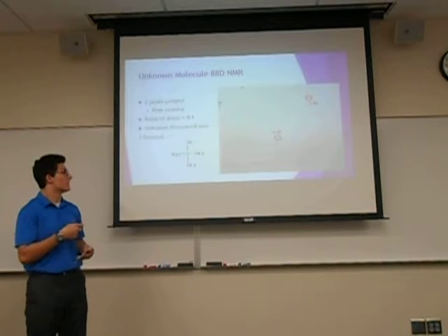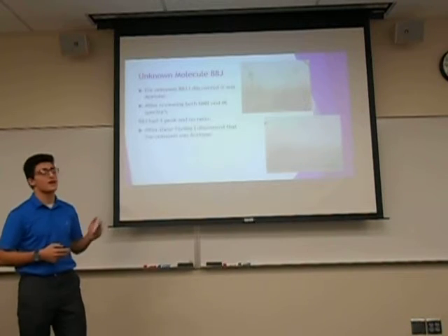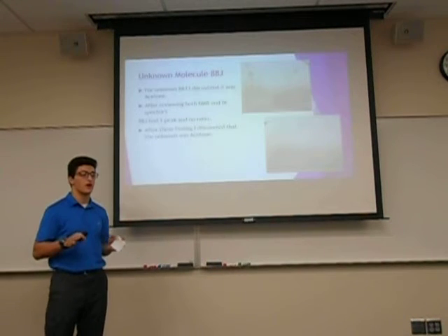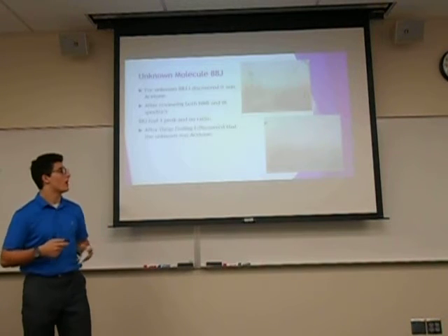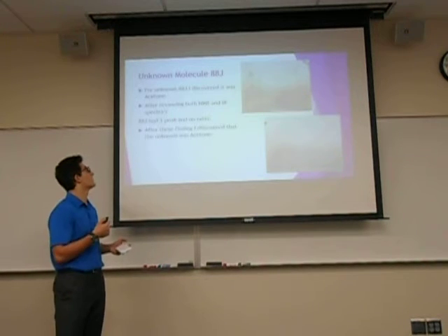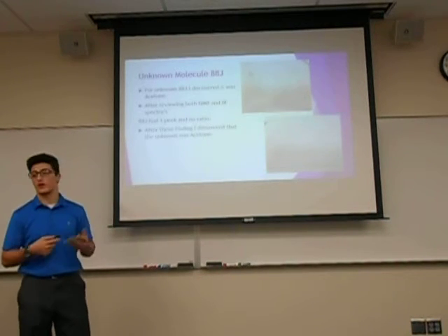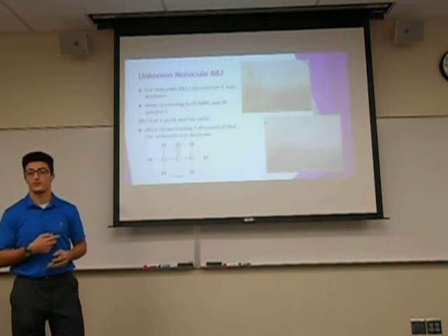And this right here is just a structure of TB1. Alright, next, 88J. On the top is my IR spectra, on the bottom is my NMR. Using the same exact procedure, what I found out was acetone. Examining my NMR, there was only 1 peak with a reading of 1, which means since there's 1 peak, there is no ratio. Once again, after doing all this, I found out it was acetone. And here's a structure of acetone.